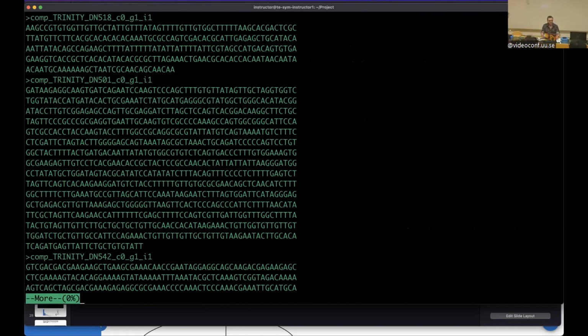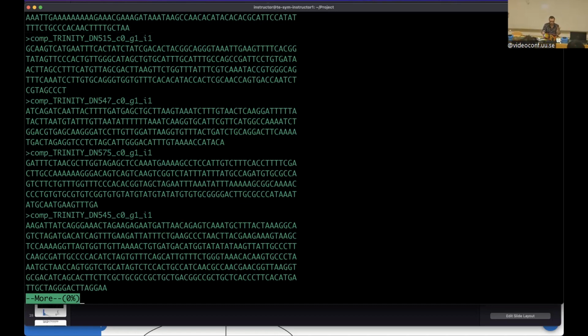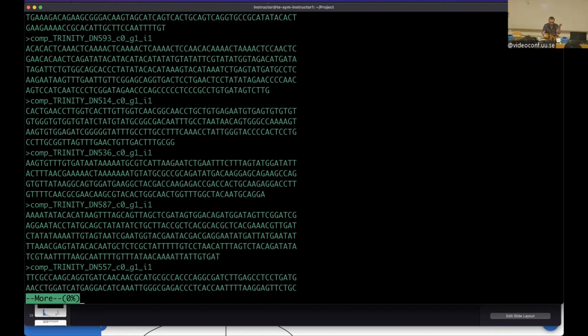All right. So this is a multi-fasta, with the nomenclature of Trinity. Once again, I don't really have too much time to describe the nomenclature, but in the tutorial there's a little blurb about it, and also a link to the Trinity documentation that explains in detail how Trinity assembles and names the different clusters. You can see many small clusters because it's expected, we are at very low coverage. We don't expect to assemble all the repeats perfectly. The ones that are the most abundant are going to be the best assembled, etc. So, okay, we can look at it a little bit.